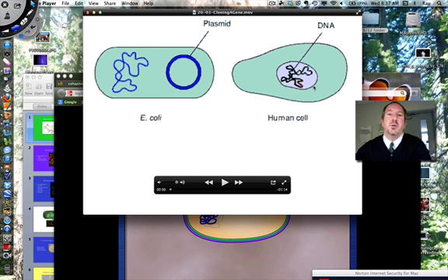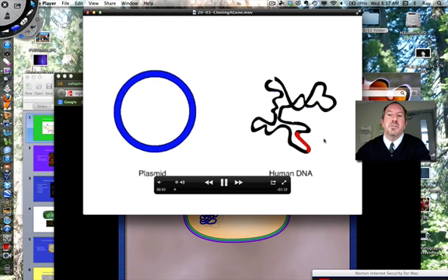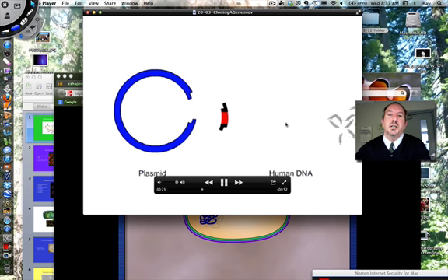Like, how do we do it? Well, there's a gene in all of our cells for the protein insulin. And so what we could do is we can take one of the human cells like this, and here's the gene that we're interested in, and this over here is a circular plasmid in bacteria. We can take an enzyme called a restriction enzyme. It's sort of like a little scissor, and we can cut a plasmid. And so this is what we do. We take plasmids from bacteria and we pipette restriction enzymes. They cut the plasmid open, and then they can also cut human DNA open.